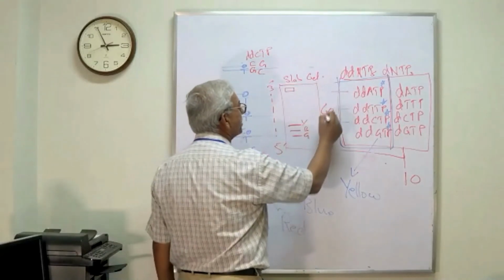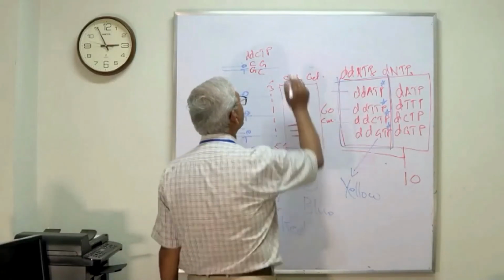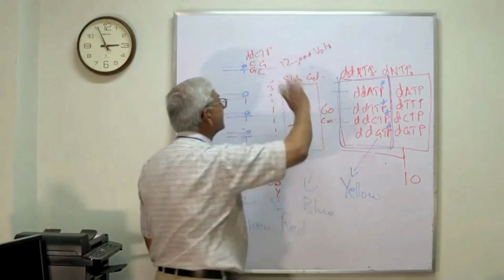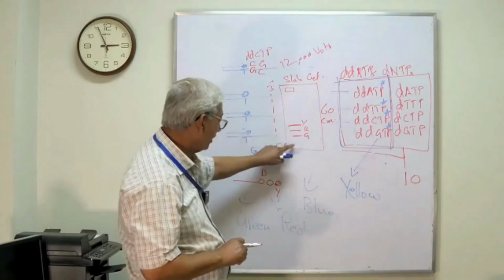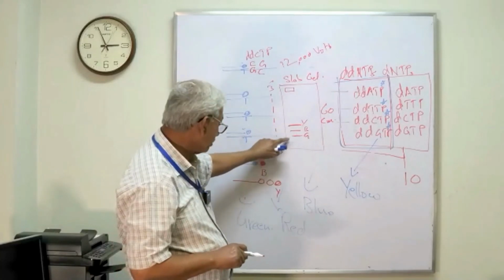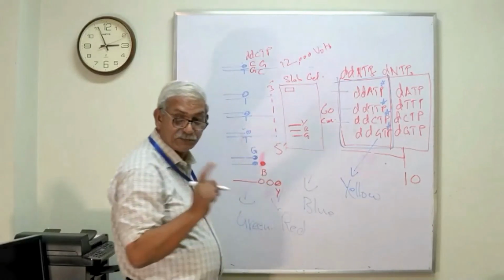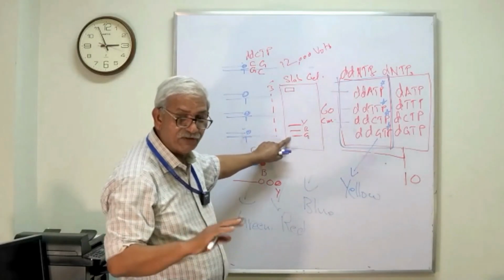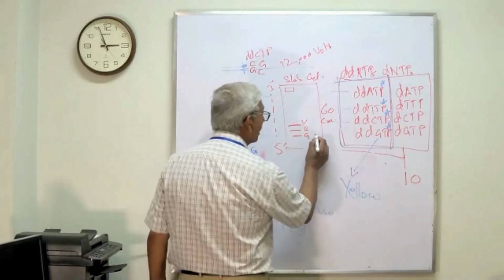This is a 60 centimeter long polyacrylamide gel, which is run at about 12,000 volts. That is a slab gel. The fragment which is farthest from the well is the smallest one, followed by the ones which are following. And each of these fragments is different from each other just by 1 nucleotide. Suppose if 20 nucleotide long is our primer, so this fragment is having 20 plus 1, 21 nucleotides.